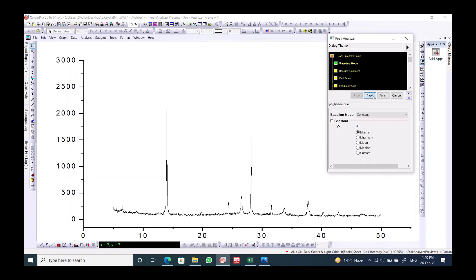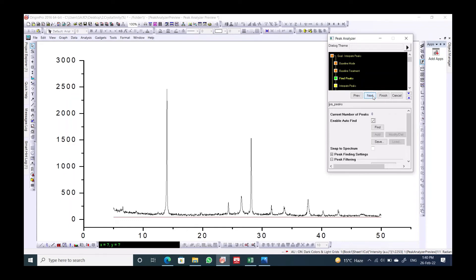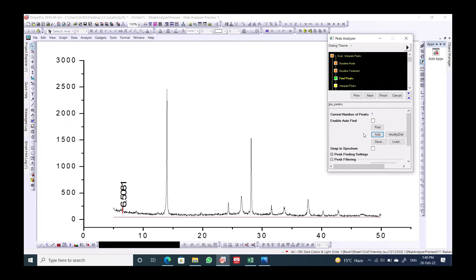Click Next, select Integrate Peaks, then Next and Next again. Disable the auto-detect option, then add a single peak that covers the whole area — including both the crystalline and the amorphous structure — then click Next.